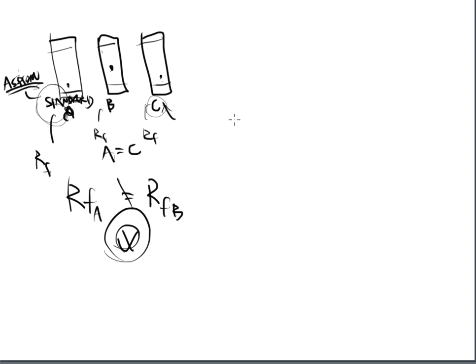That's what we do in TLC. And that's really all that we do in TLC. Remember, TLC qualitates. And that's what we've just done. We've qualitated it. We've told you what is present and what is not. The TLC plates do not traditionally quantitate. That means I've identified that aspirin is the unknown that was provided. I don't know how much. I don't know the concentration, but I know that C is probably aspirin. That's qualifying.